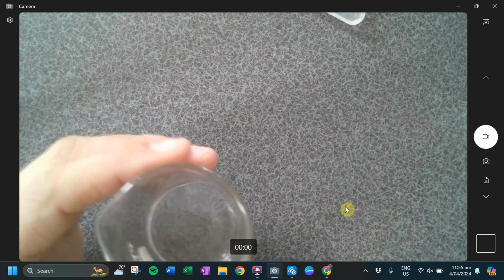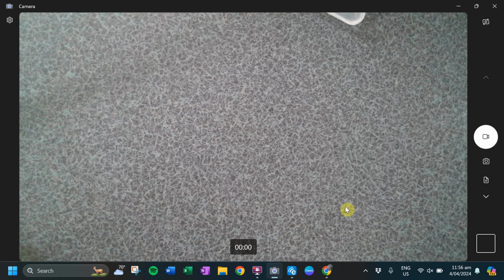Wait, am I doing it right? I'm just thinking. Hold on. Oh, am I grabbing the right thing? I was grabbing the wrong thing, guys. Sorry, my bad. That's why it didn't work.